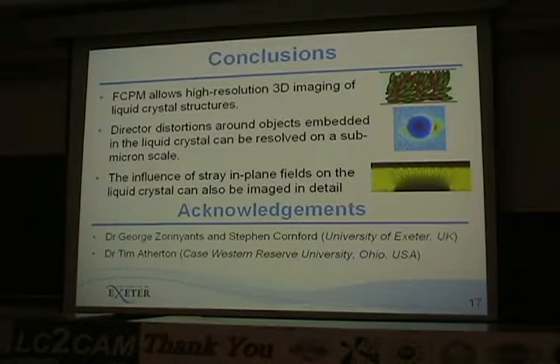Why it's periodic, I assume it's because we've got this 5 micron pitch, this dopant to make it cholesteric, so you're getting quite a play-off between your surface anchoring energy and your elastic energy within the bulk. So it's something that we're going to have to put into our models and try to account for. It's going to be tricky to model.